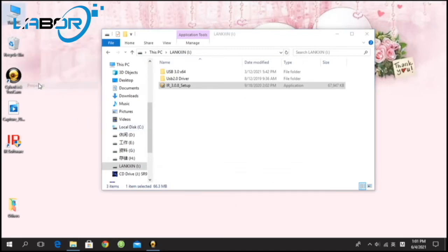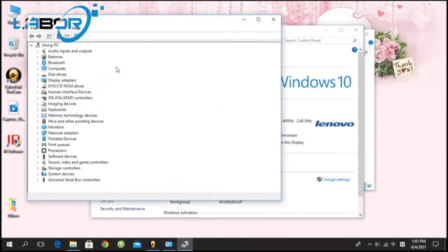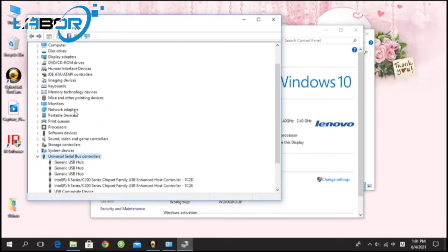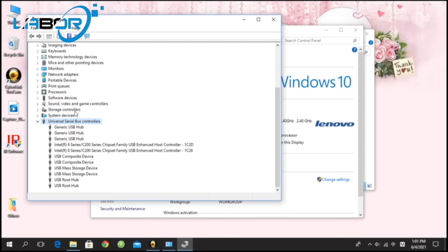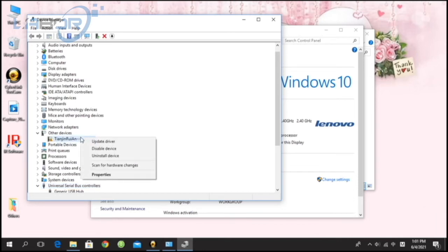Now we need to install the USB driver. A problem happens — we can't find our FT-IR driver in this list. So we reconnect the USB power card of FT-IR spectrometer. Finally, we find it. The driver name contains the word Tianjin.